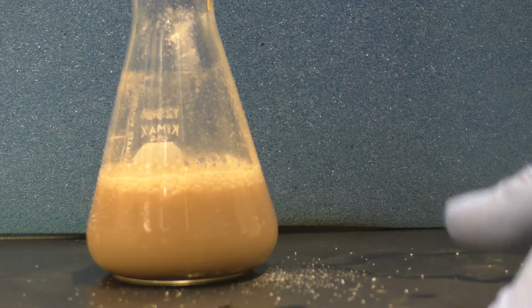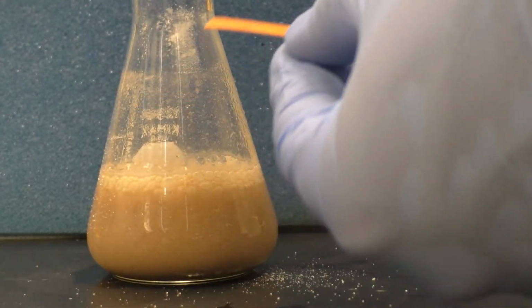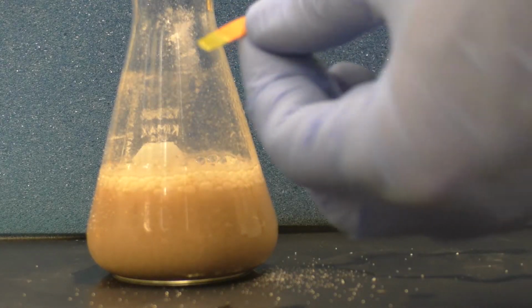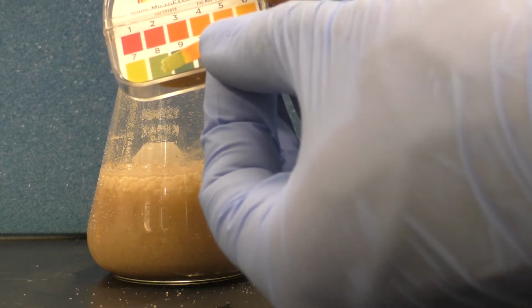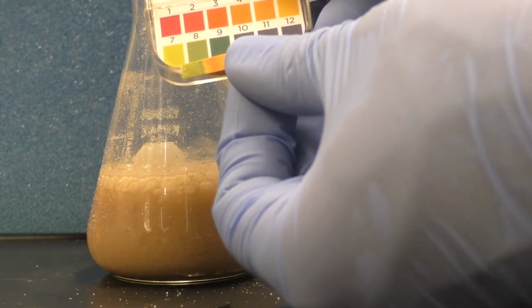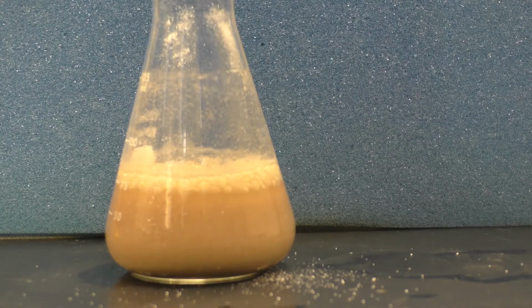I'm just going to test the pH of that solution one more time. Oh, and there we go. Now it's showing green, which is essentially just in our 7 to 8 range. We have neutralized the solution. We no longer seem to be getting that foaming anymore. We are now set to take this to the vacuum filtration setup and collect this material on a Buchner funnel.